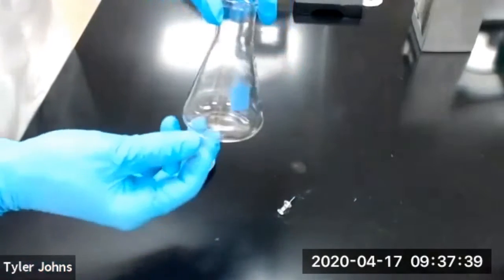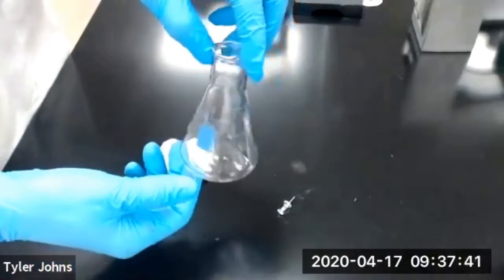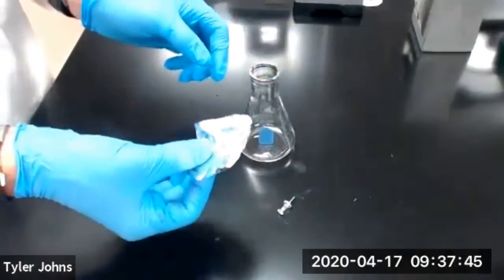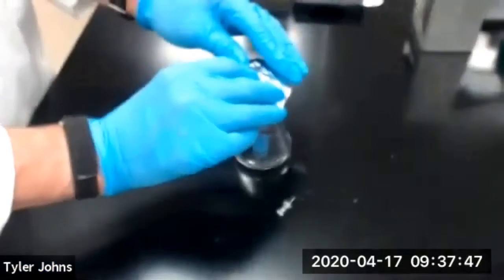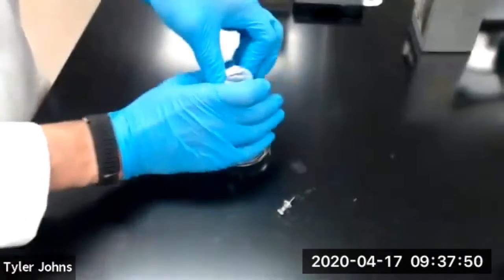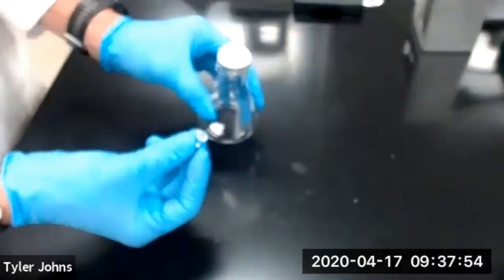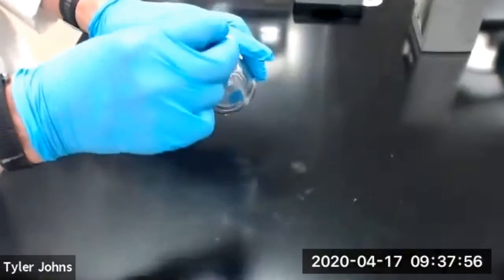Then we're going to take a clean dry 125 mL Erlenmeyer flask, make a lid with a piece of foil, and we're going to poke one small hole with a push pin through the foil.